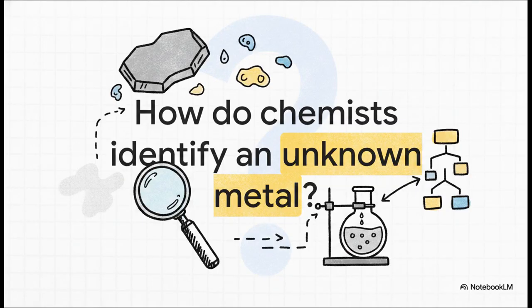So picture this. You're handed a completely random piece of metal. No labels, no hints, literally nothing to give it away. How do you identify it? Well, today we're going to learn exactly how to deduce its identity using a really clever technique. No guessing required. It's a precise, logical deduction where we actually look at what's left behind rather than just directly measuring the metal itself. Pretty cool, right?